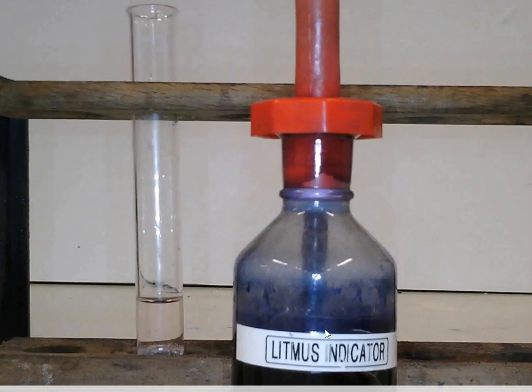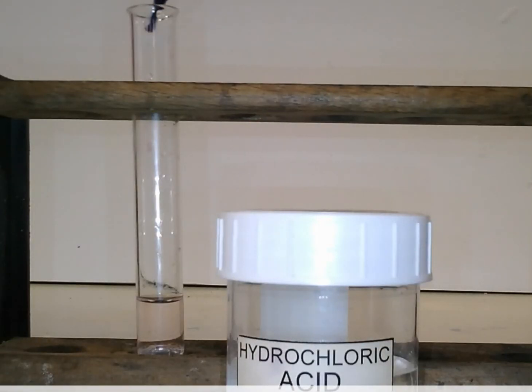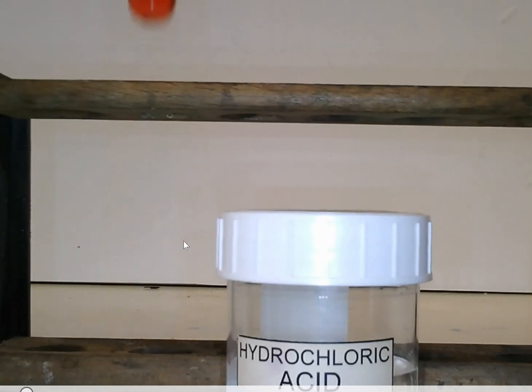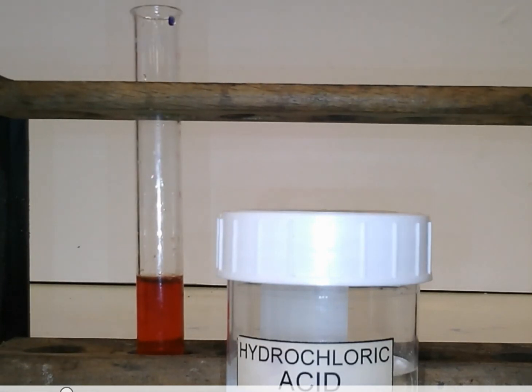Okay, so here you can see our litmus indicator, and we're going to go through testing the different things. So our first is we're going to test hydrochloric acid by adding a few drops of litmus indicator. I'm adding quite a lot, so you can get some nice strong colour for the video. So, it turned red, so you would add hydrochloric acid in the column of your table that asked for things that turned red.